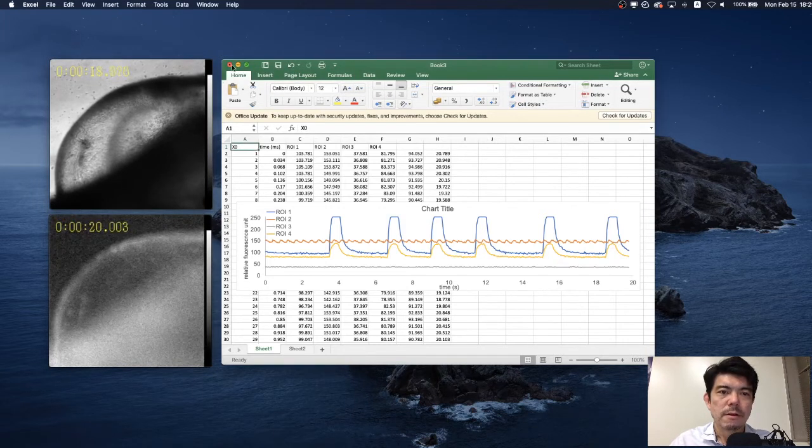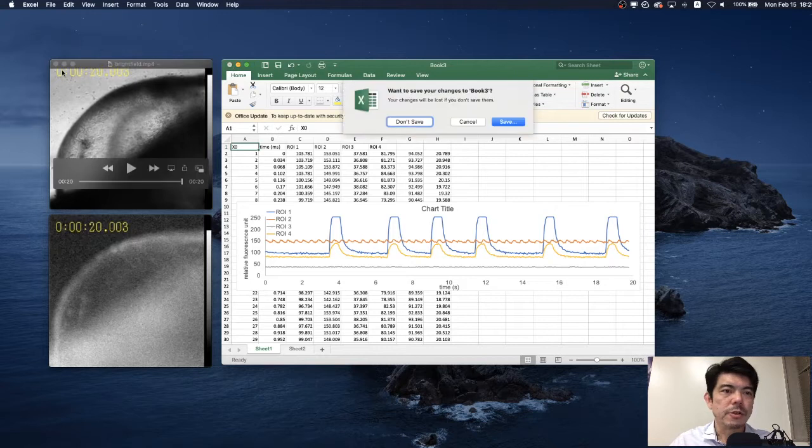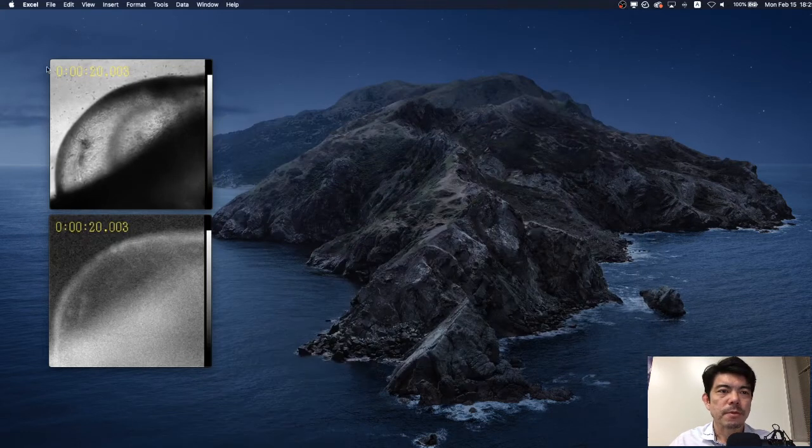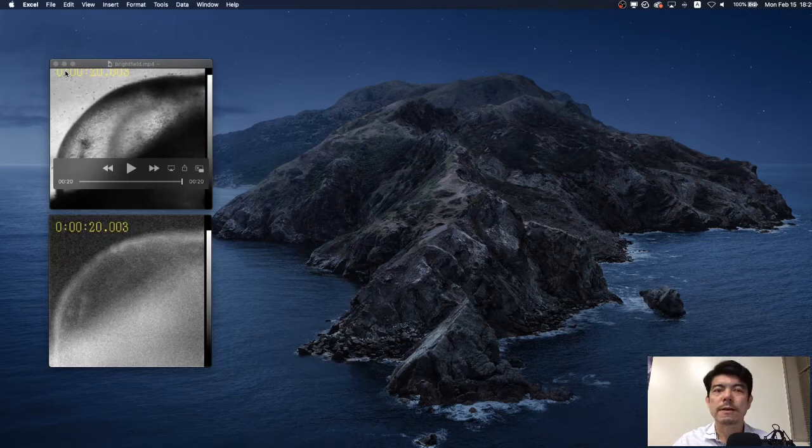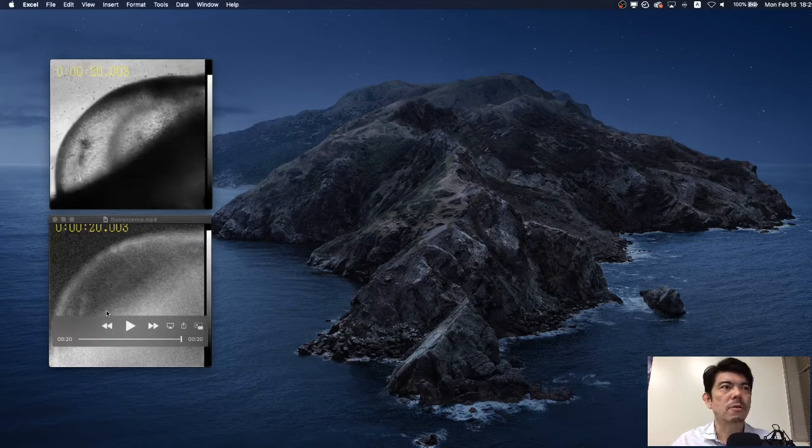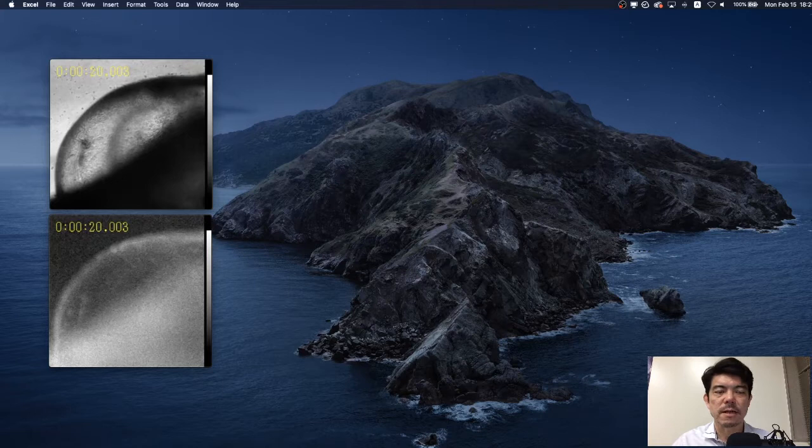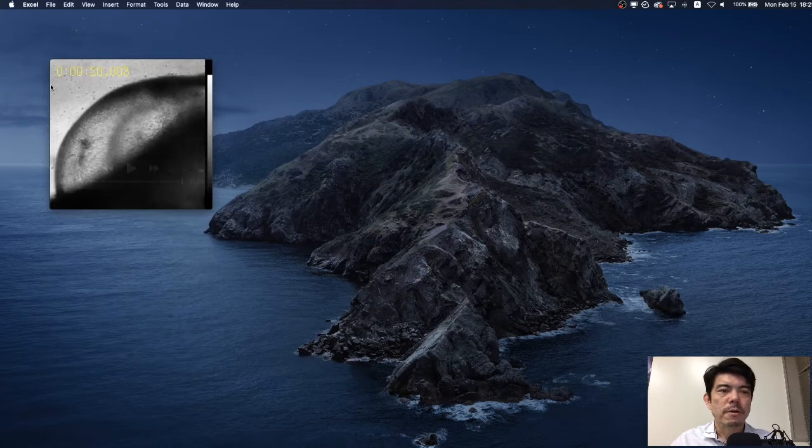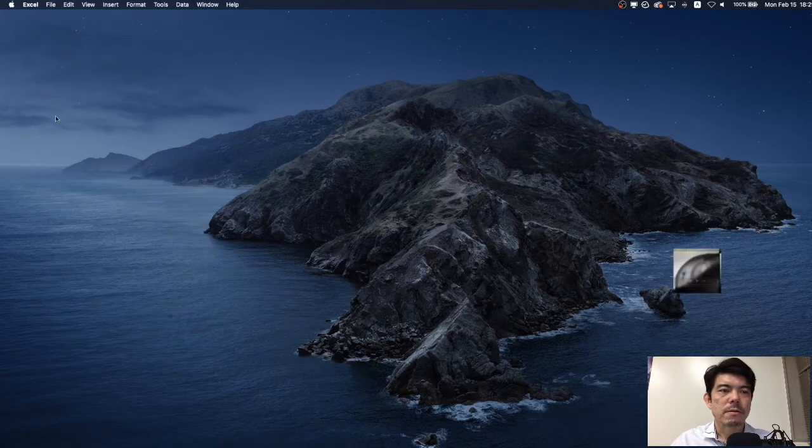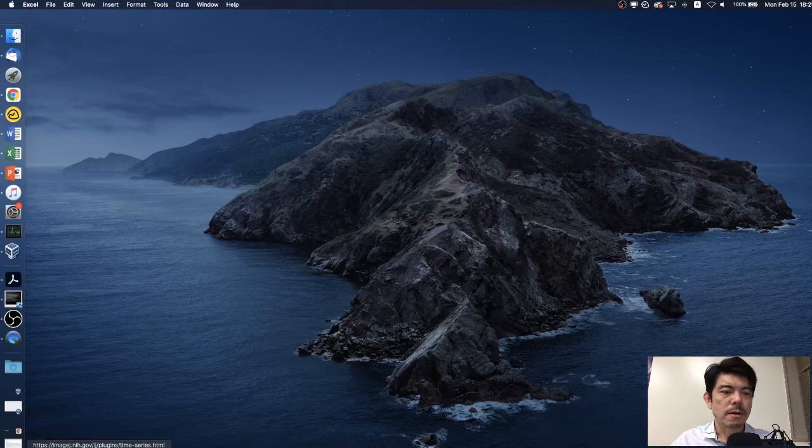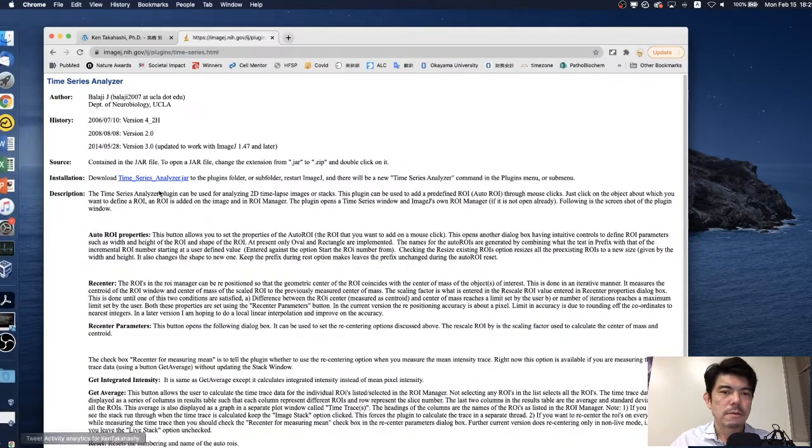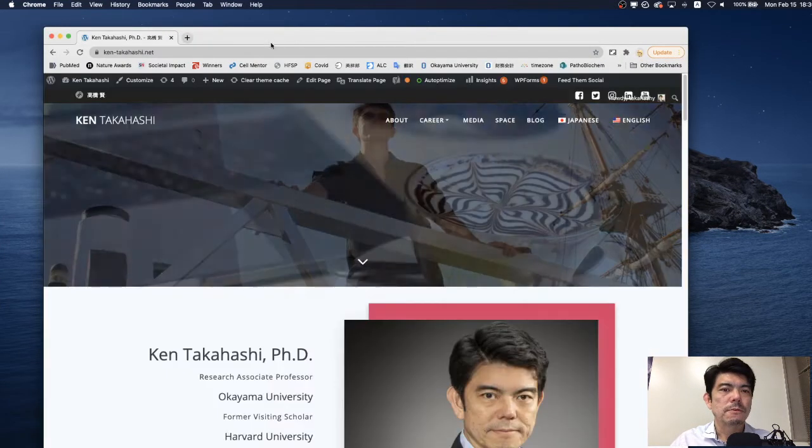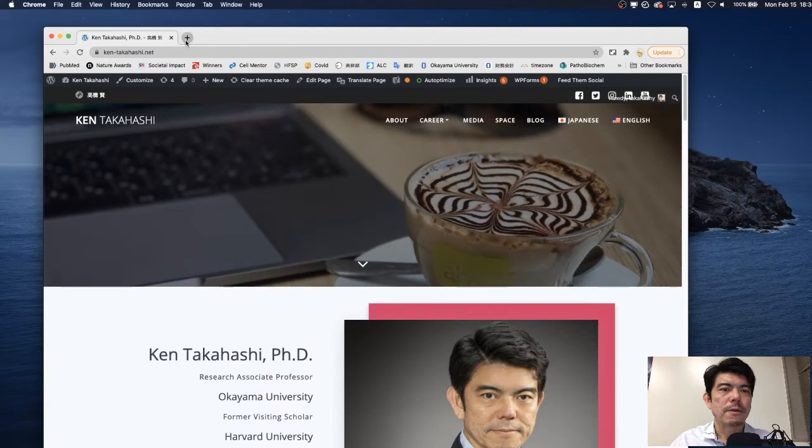For that purpose we use ImageJ, but before that we have to add specific plugin which is called the Time Series Analyzer. Now we go to internet and search for that.